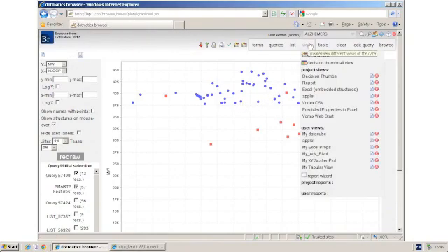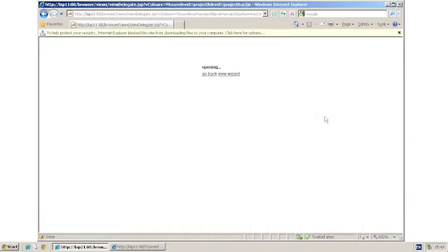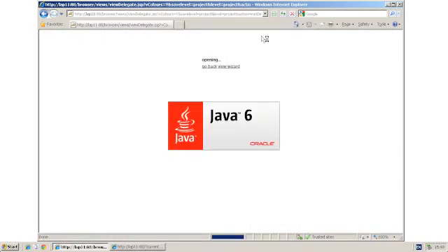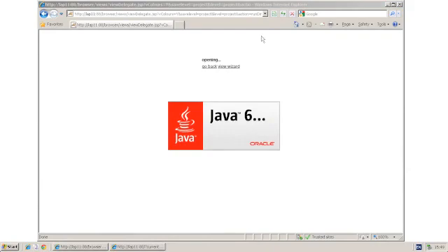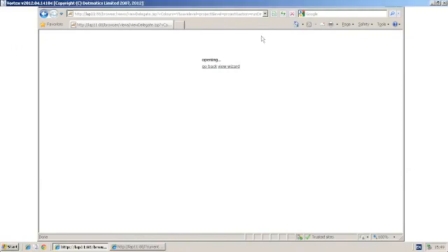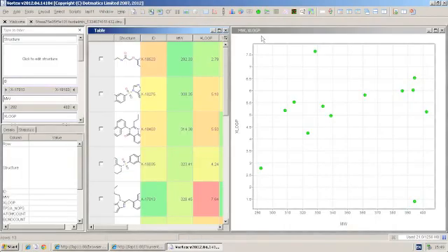Also on the views menu, we can see Vortex. Vortex is the interactive querying and reporting tool from Dotmatics. It's being launched here from a Java Web Start, so I don't need to install the application on my local machine.